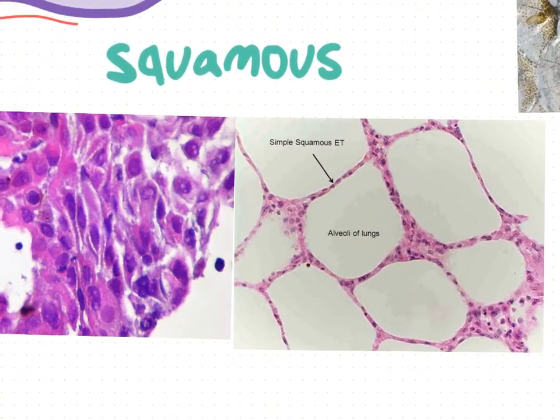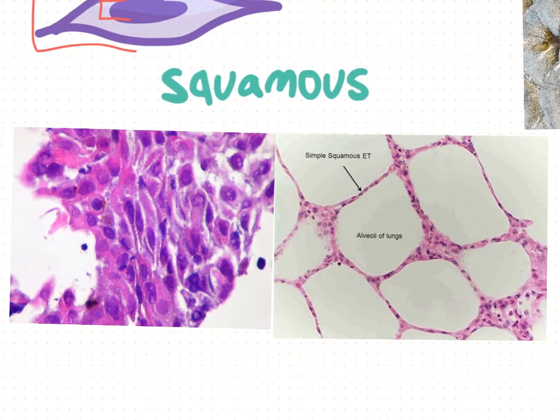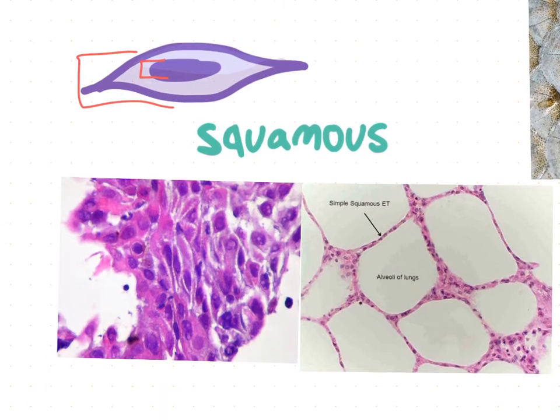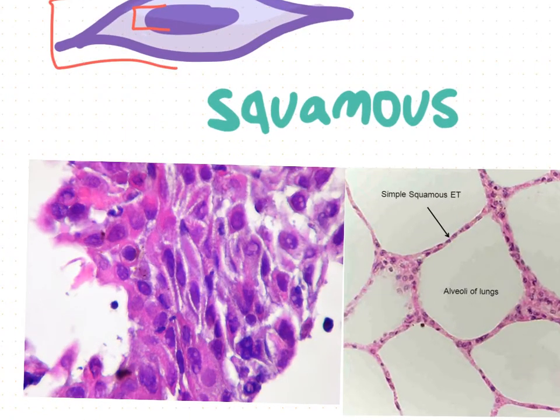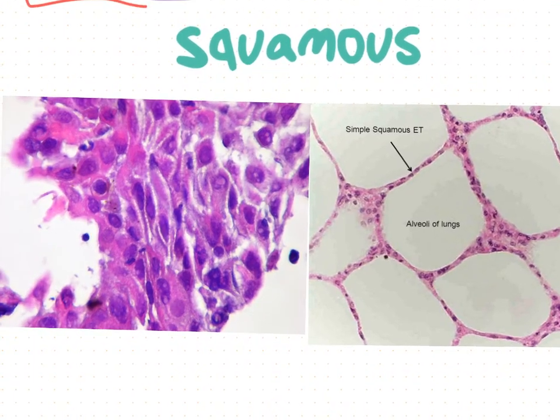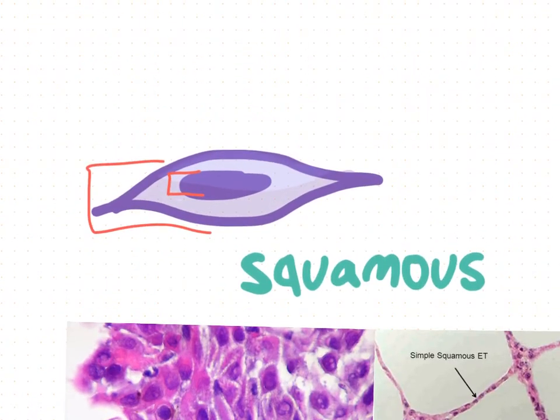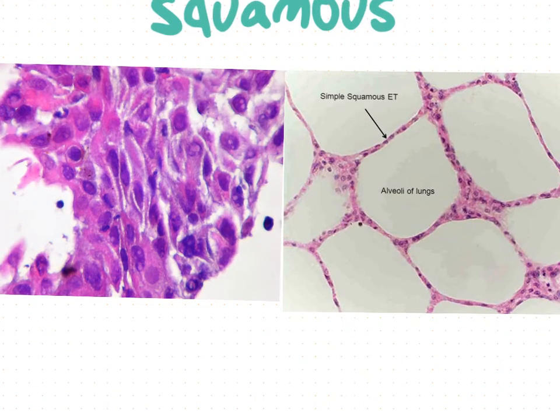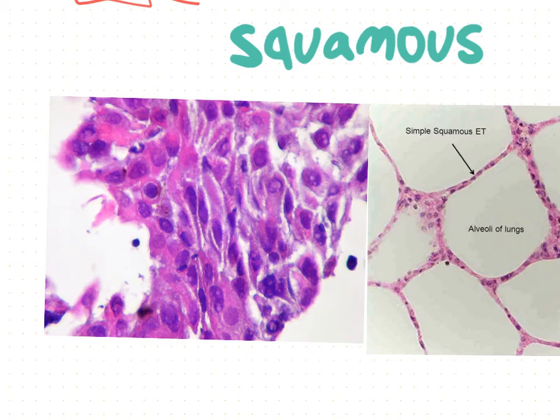So here I actually have two photos of how squamous cells look under the microscope. As you can tell, it looks a little bit different from the way that it's depicted through drawings, just because in my opinion it looks a lot more thin in some places and more swelled in others. In drawings, it often shows two tapered ends compared to one swelled area, correct? But in some of these actual photos under the microscope, it doesn't look exactly like that, but pretty similar, right?